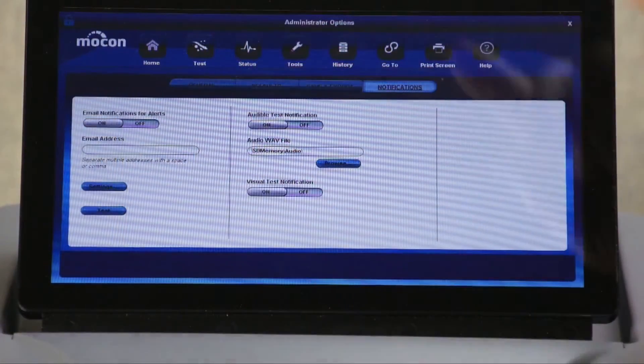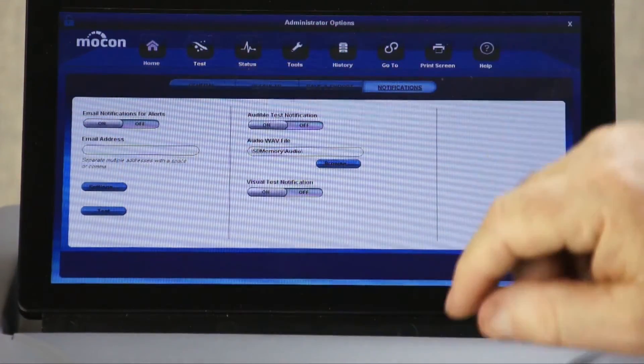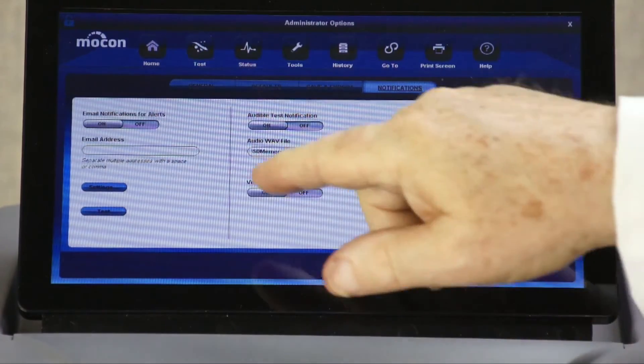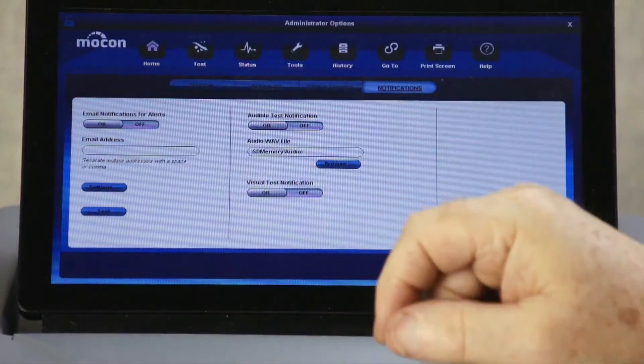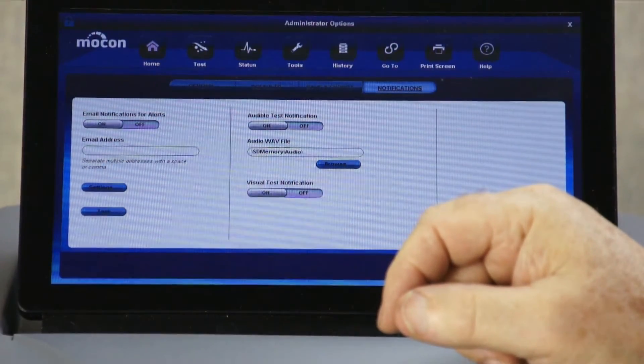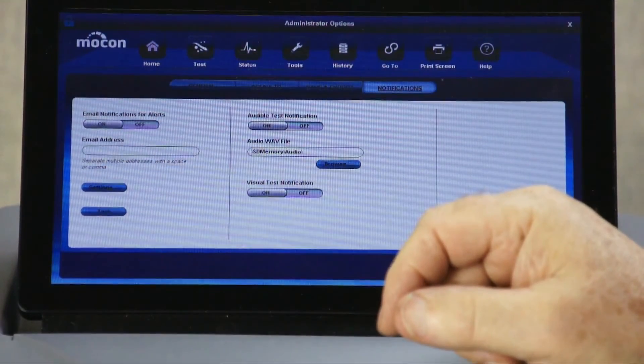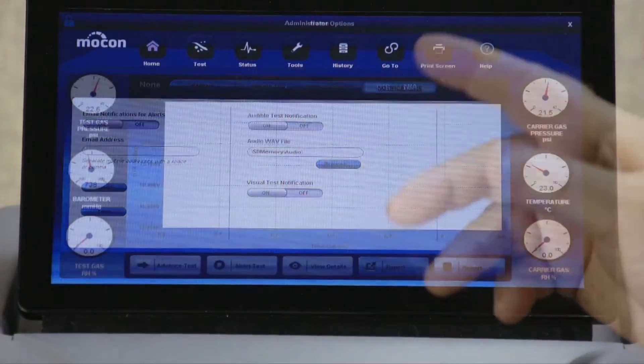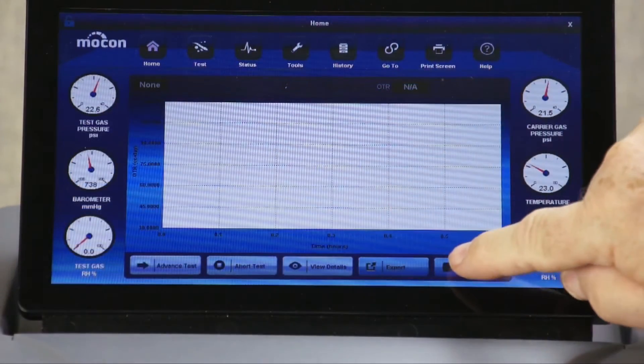Your operator can now receive automatic emails when a test has been completed or if there has been a test error. You'll always know when a test is completed, no matter where you are.